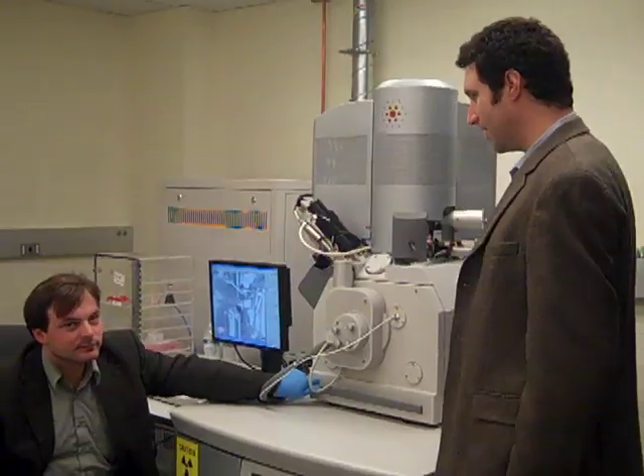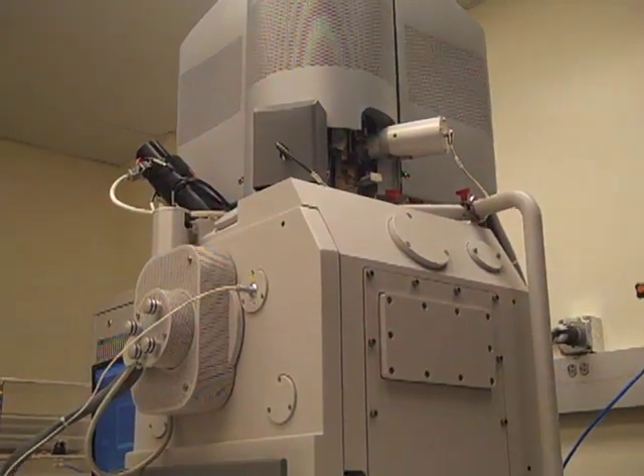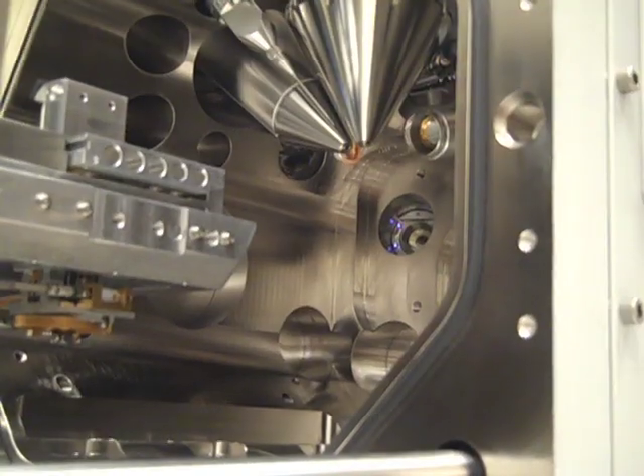For a number of years now, we have been working on developing techniques for doing small-scale tests inside an electron microscope. There are two main advantages for doing this inside an electron microscope. Number one, if you want to test something really, really small, it's really hard to do it without looking at it. So it helps you to find the sample, position your indenter, and all this kind of stuff inside the microscope.